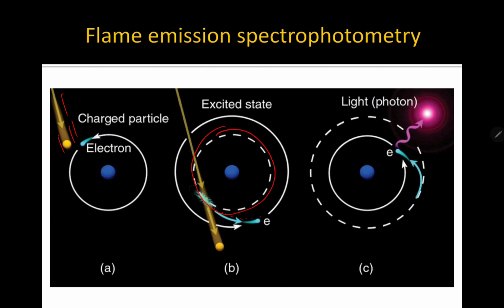not last long. The excited electron does not stay in the excited state permanently. However, it will eventually fall back to the ground state. So it will eventually go back to its orbital. Ayan, yung parang sa orbital niya. After niya magkalat, babalik na naman siya sa kanyang pinanggalingan. So yun tatandaan ninyo. So ngayon, bakit ko ine-explain yan? Because when the electron falls from the excited state, it loses energy in the form of light.